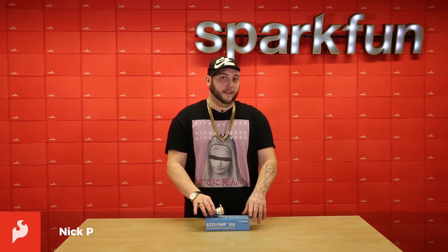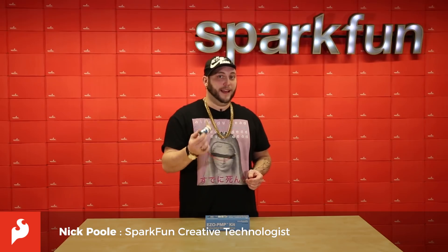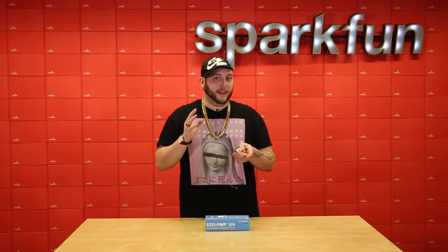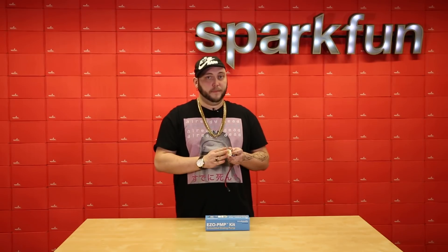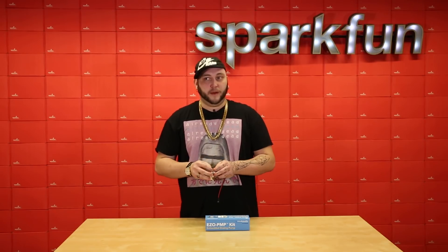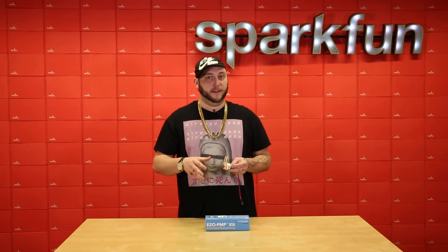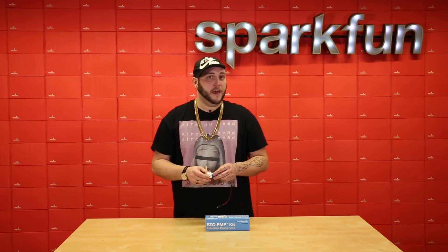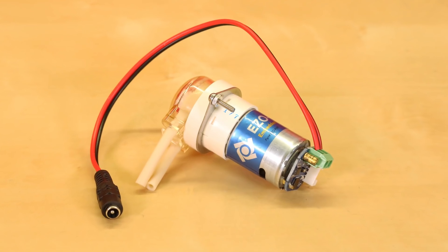The EZO PMP kit is designed to get you started with the EZO PMP dosing pump from Atlas Scientific. A cool thing about this pump is that it is a small peristaltic dosing pump. We've talked about peristaltic pumps in the past in relation to things like the bar bot and other beverage dispensing robots, but there are a few advantages to using a peristaltic pump in a lab setting.